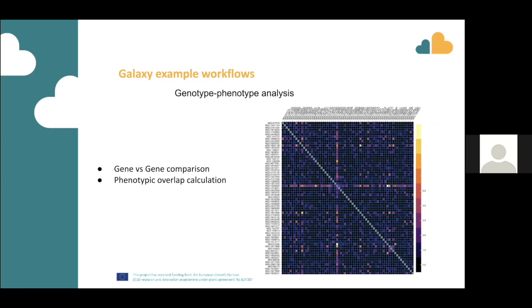So this is, for example, a workflow which we developed already beforehand and also used with other data inside Galaxy, which performs a gene versus gene comparison. In fact, the tools which we developed and use here compare the genes against each other and show you the phenotypic overlap.